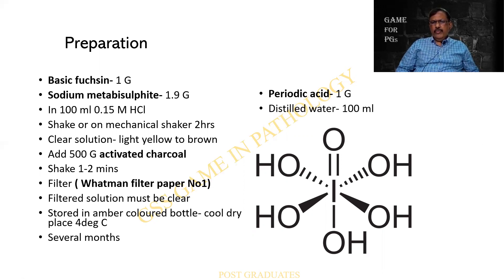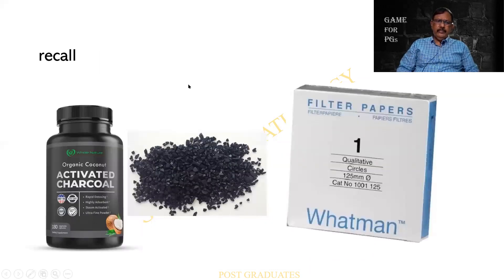And there is a secret of it — every container that is being used for the preparation of the PAS must be rinsed in distilled water before proceeding. Tap water will be a contaminant. This is activated charcoal, which can be acting as a filter, and this is the Whatman's filter paper number one.